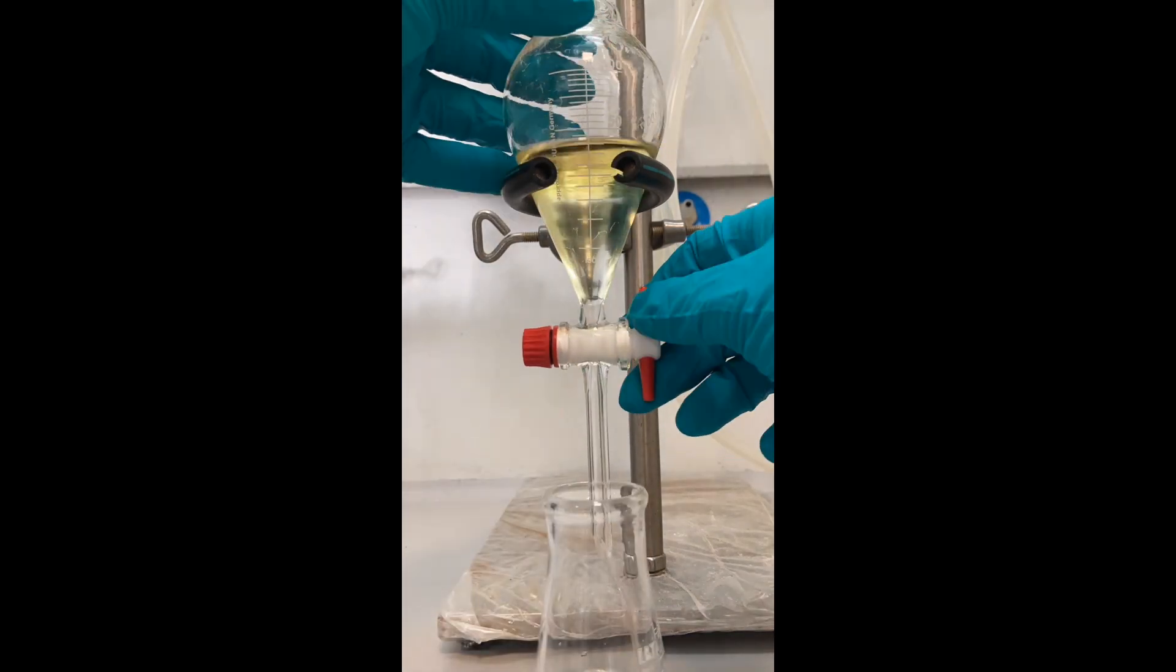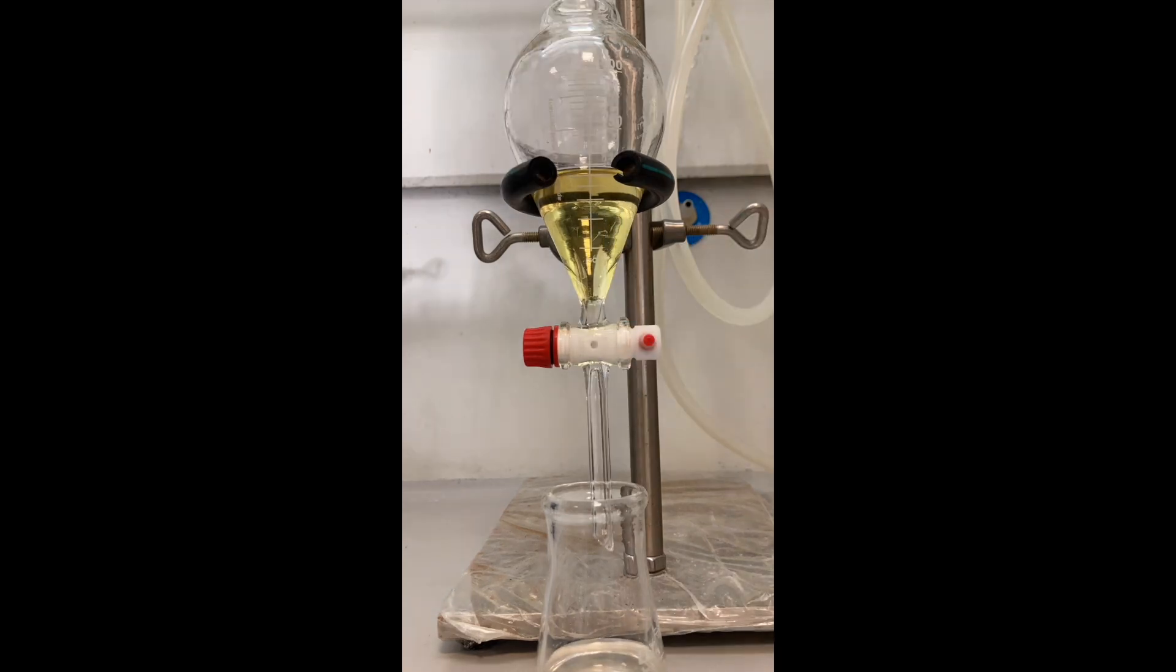And after drying the resulting organic extract with magnesium sulfate, I added some silica gel to prepare the dry loading for my flash column chromatography.